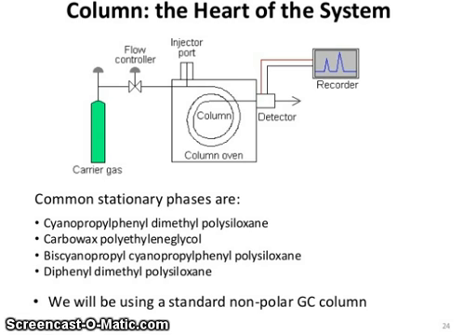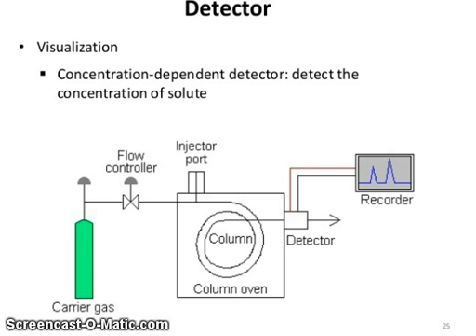We will be using a standard non-polar GC column. So what is a detector? Concentration dependent detectors detect the concentration of solute.